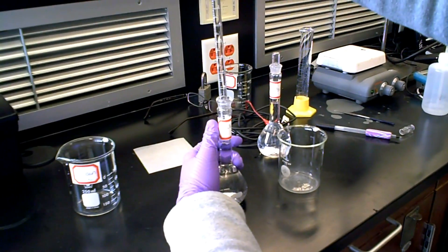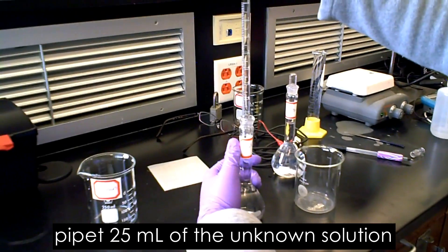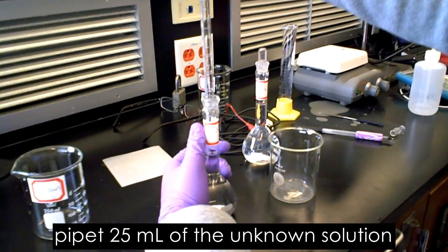Then you will pipette 25 milliliters of the unknown solution into a 250 milliliter beaker.